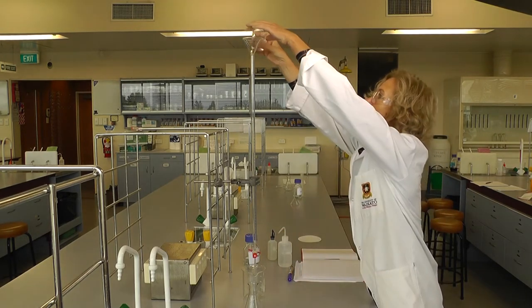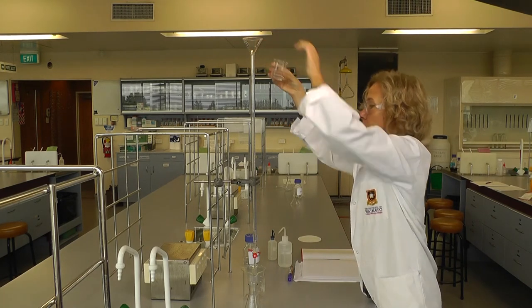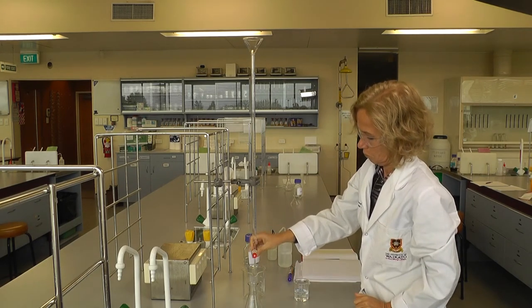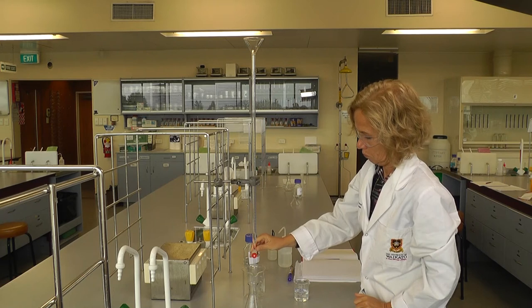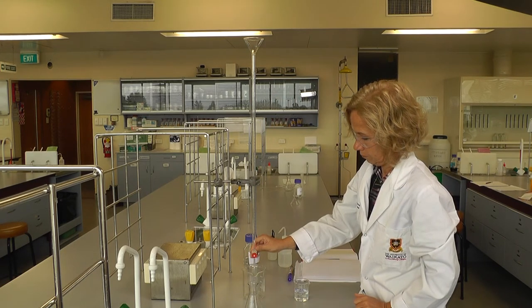Pour a small amount of stock solution into the burette, making sure the solution comes in contact with as much of the inside of the burette as possible. Drain this solution into the waste beaker and repeat the rinsing process a few times.